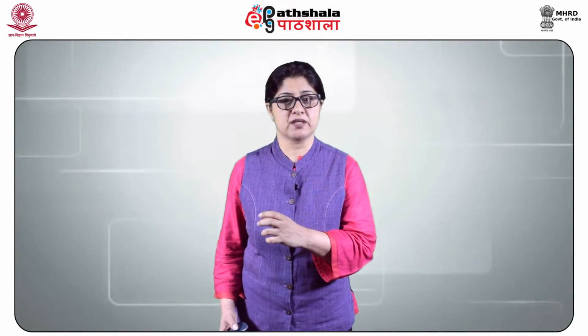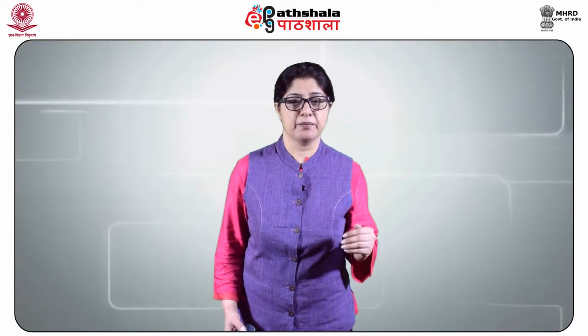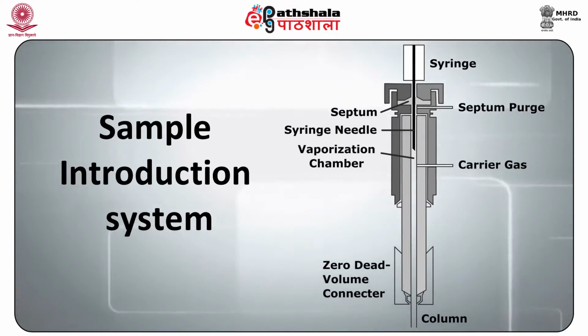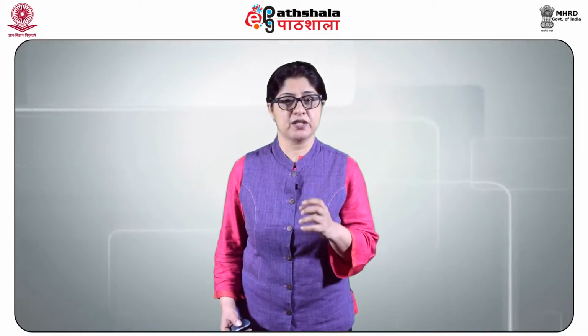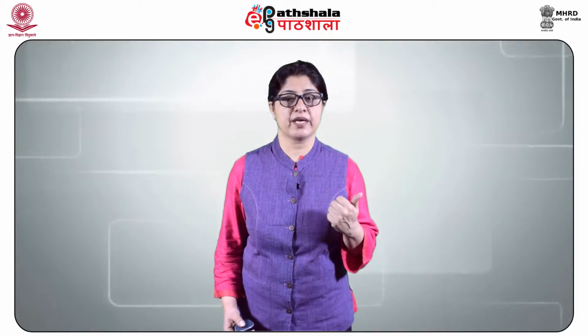Sample introduction system. The sample introduction system is very vital as a very small amount of the sample is injected into the column. The system must introduce a sample in a reproducible manner and must vaporize it instantaneously so that the sample will enter the column as a single plug. Liquid samples are commonly introduced by hypodermic syringe through a self-sealing rubber septum to a small inlet chamber which may be heated to cause flash evaporation. The temperature must not be so high that it decomposes the sample. The solid sample must be dissolved in a volatile liquid for introduction or may be introduced directly if it can be liquefied. Gas samples require special gas sampling valves for introduction into the carrier gas stream.